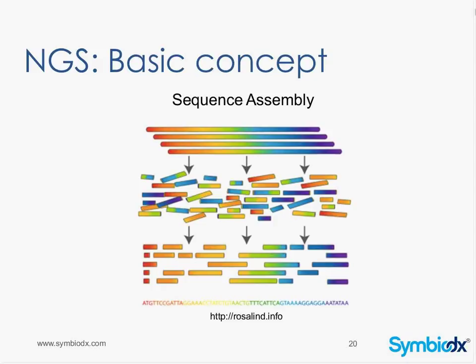The other way is called resequencing, and what we do in resequencing is we have the known human genome sequence that we're comparing to, and we line these up in relation to that sequence and then determine which areas are different. Resequencing is what almost everybody uses, unless you're looking for some new organism, a plant or a bacteria or something where you don't know the entire genome. The de novo method requires a lot more IT, requires a lot more bioinformatics analysis, and it's prone to errors in those same regions of repeat or insertions or deletions.